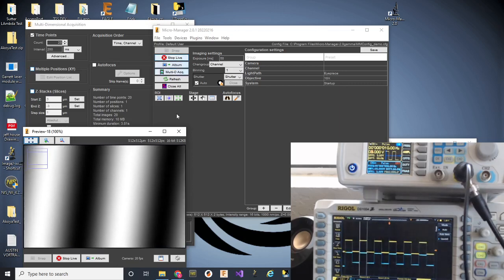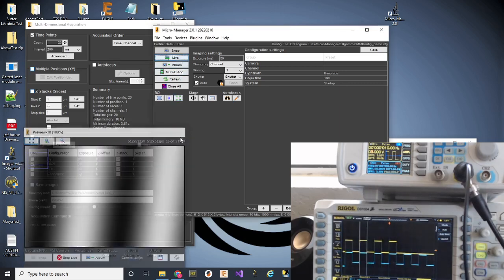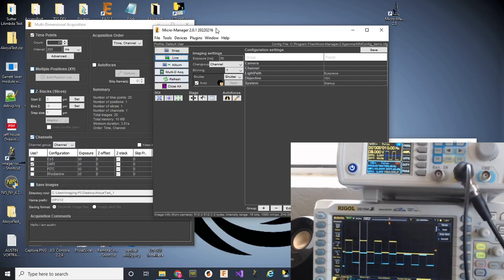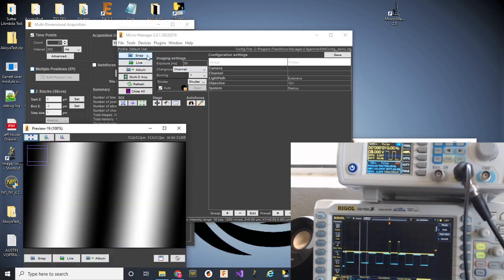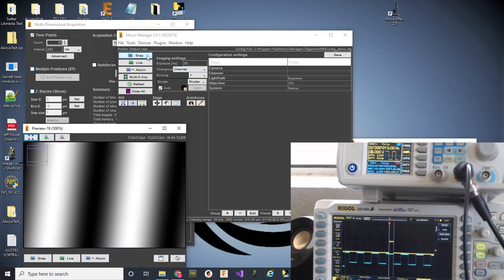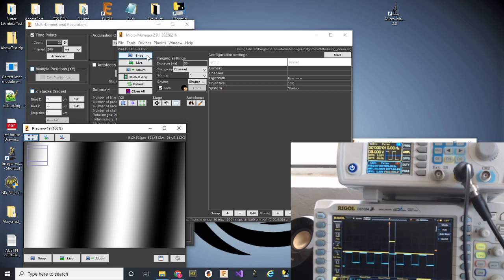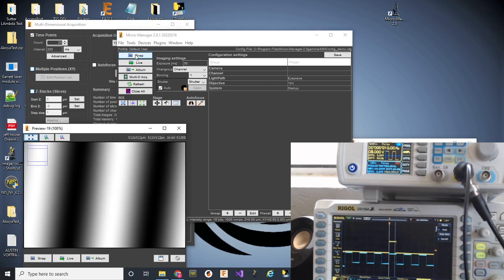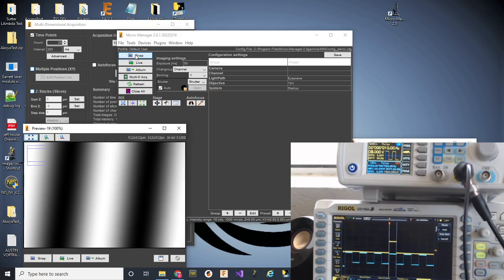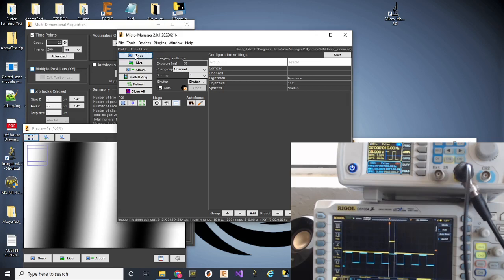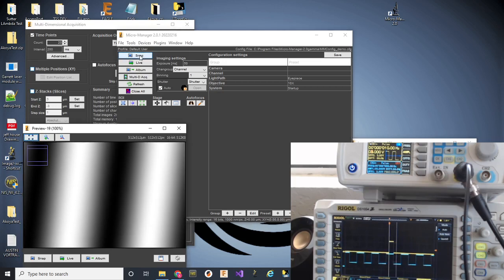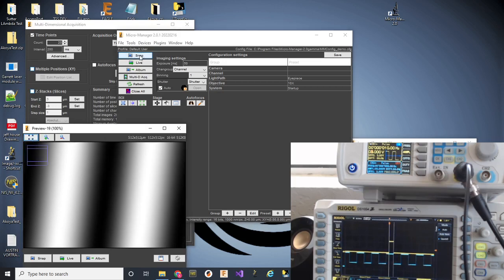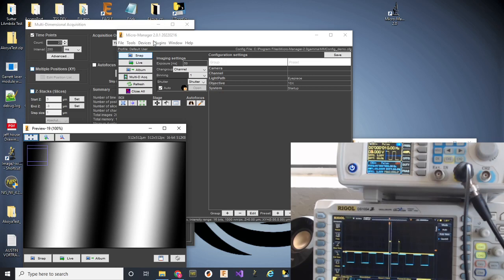Let's do something a little different. What I'll do is I'll just snap an image. Here what's going to happen is the system will only go high when the software says to turn on. So, in this case, it's for the duration of the exposure time and when we catch that blue line being high. And because this isn't real, the two are not correlated, but you kind of get the general idea that it'll only be high when both items are logically booleaned on. Like in this case, the exposure line started and then we caught the tail end of one input on and then the beginning of a second input and then the exposure time ran out.